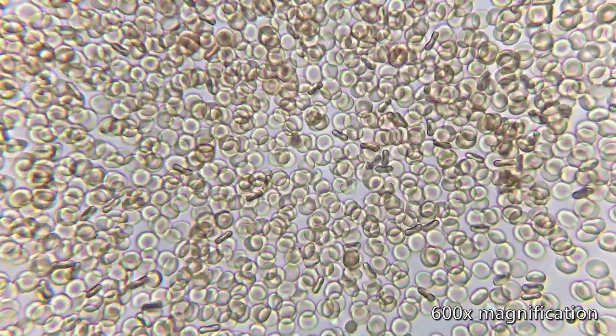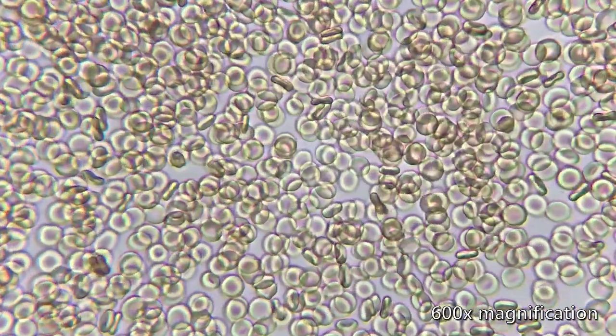This range of magnification allows me to observe anything from small insects to individual cells and bacteria. A lot of people think that a higher magnification is always better, but I very rarely go above a total magnification of 400. You are able to see a lot of different microorganisms with the 4, 10 and 20x objective, and each increase in magnification only makes it harder to track your specimen and more difficult to produce a nice and sharp image.